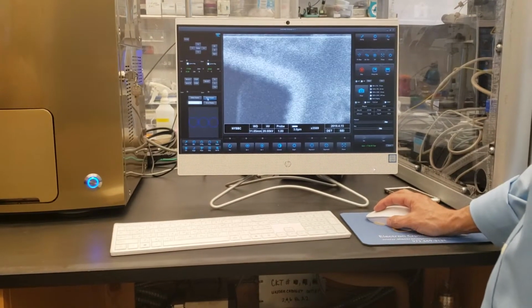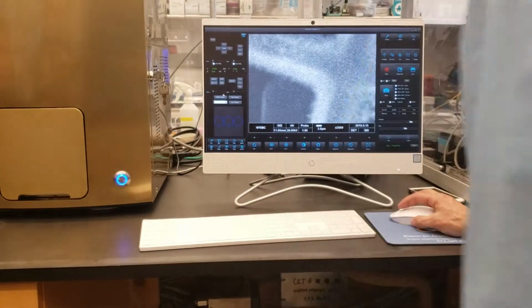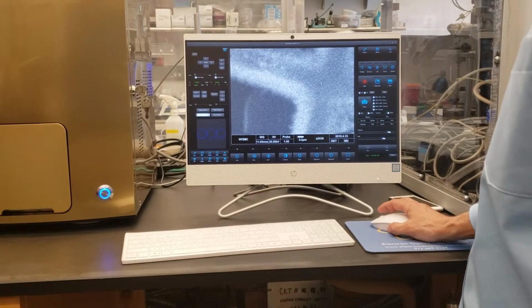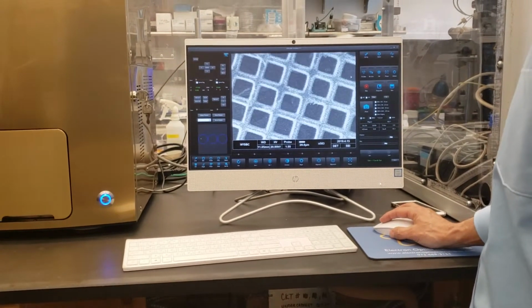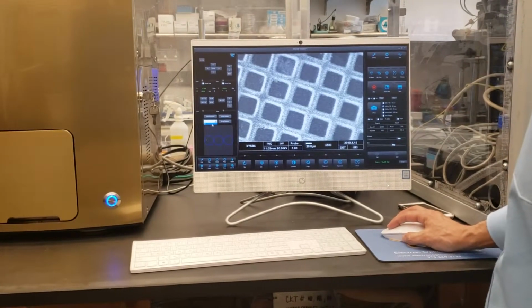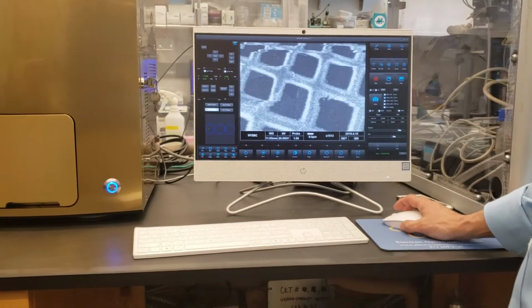Like for instance, if you wanted to save this position, you would give it a name, like, I don't know, Jim, and hit enter, and that position would be saved. So that's under Jim. If I was to move this somewhere over here, and I want to go back, I would just select position Jim, and go to position and move back to that original position. So you can always recall.